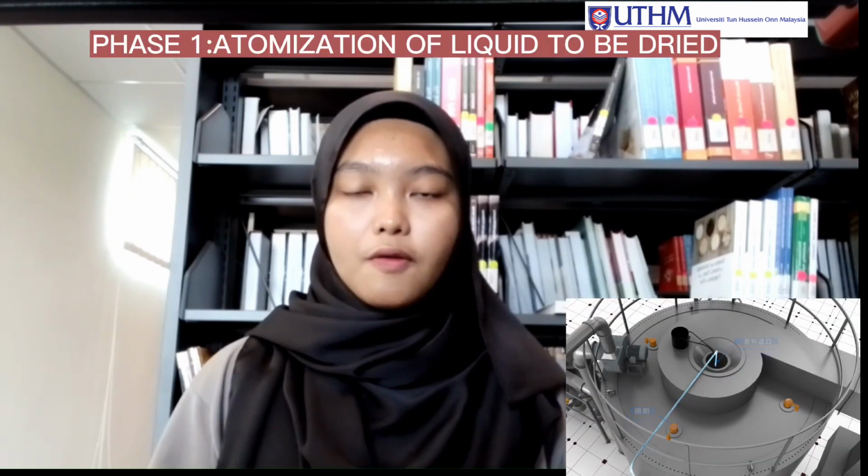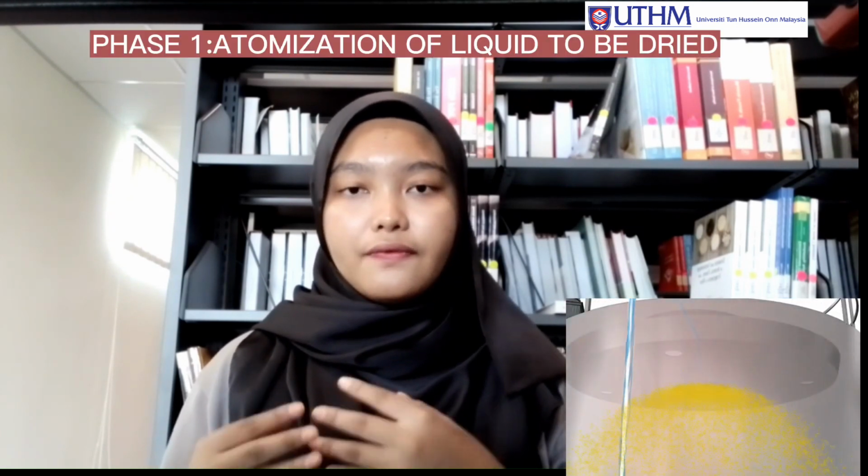The spray dryer involves 4 phases. Firstly, atomization of the liquid to be dried. This phase begins when the spray nozzle starts to rotate, and the liquid stored then flows to the spray nozzle and comes out. It forms small droplets via pressure. The properties that develop from this phase are the particle size and also the viscosity.